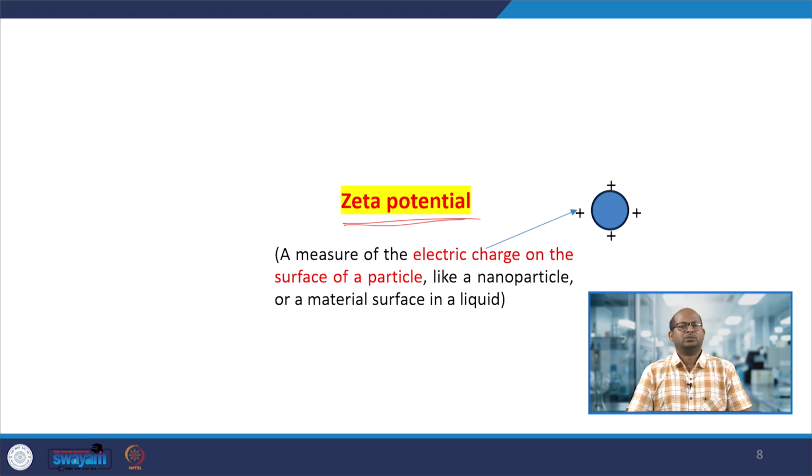Sometimes we need a stable solution where nanoparticles are distributed in a particular solvent to improve thermal properties or other properties of the material, such as mass transfer and heat transfer properties, meaning thermal conductivity. We can use nanoparticles with any particular or specific solvent for many such things. Also in the preparation of nanomaterials by solvent precipitation or some other way, the zeta potential is very important.